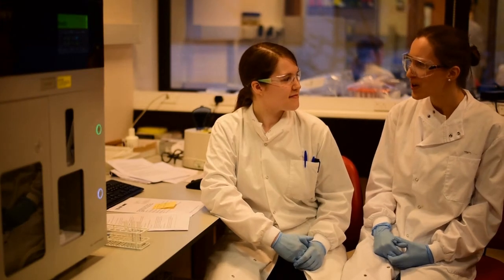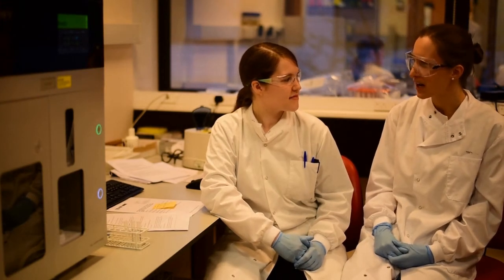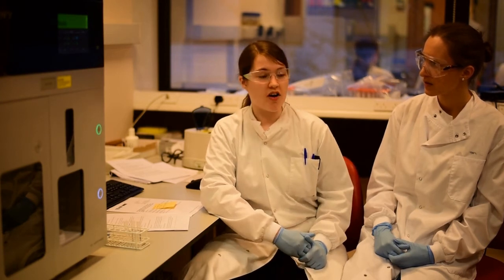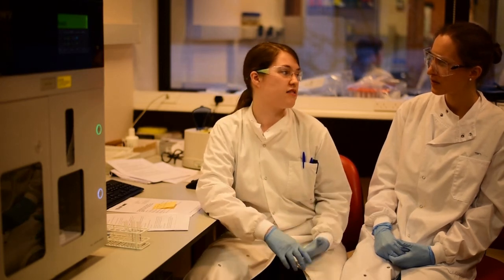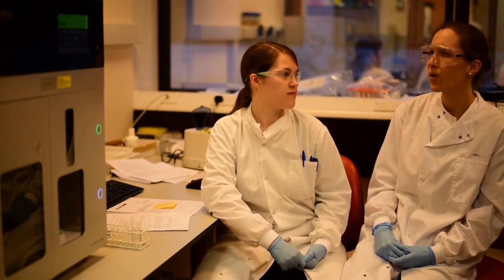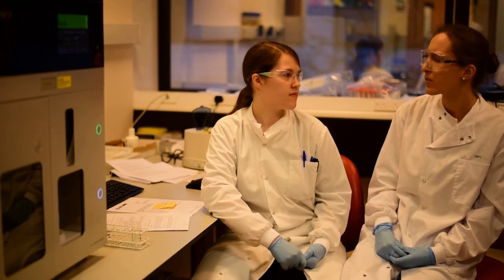Wow, that's fantastic. So how many colors can you do in parallel? On this machine, we can look at six different colors, but on our best machine, we can look at up to 28 different colors. 28? Oh wow, that's a lot more than a microscope. Yes, but keep in mind that with flow cytometry, we can't find out where the protein is inside the cell. Okay, so what do you use flow cytometry for then?